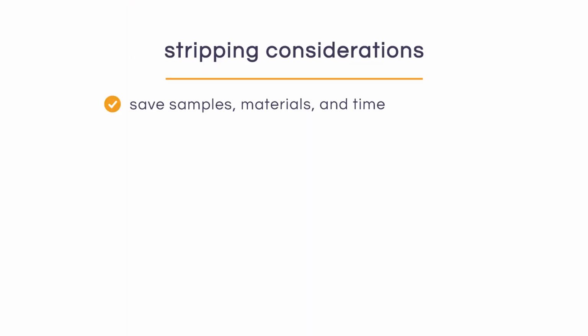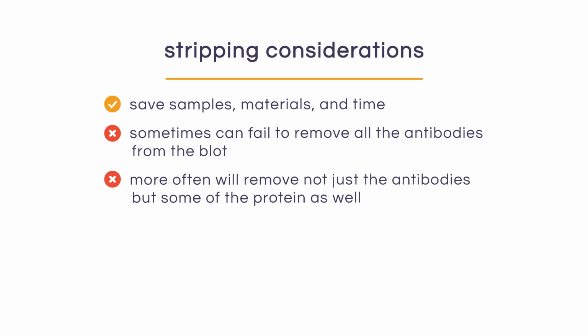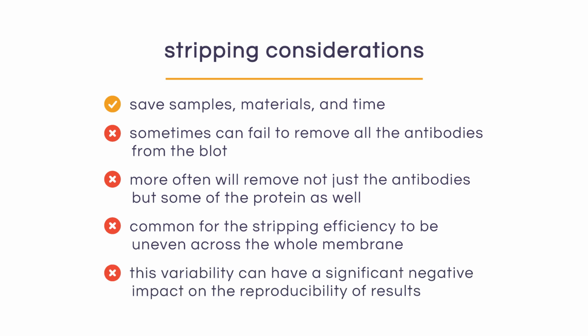However, stripping unfortunately has several key disadvantages. Sometimes the stripping process can fail to remove all of the antibodies from the blot, but more often it removes not just the antibodies but also some of your protein as well. It's also very common for the stripping efficiency to be uneven across the whole membrane. As you can probably imagine, unfortunately this variability can have a significant negative impact on the reproducibility of your results.